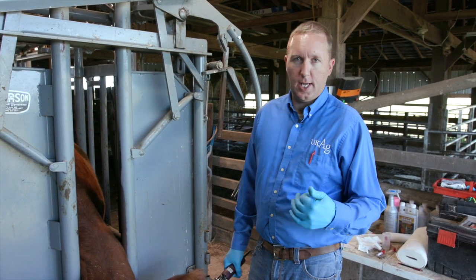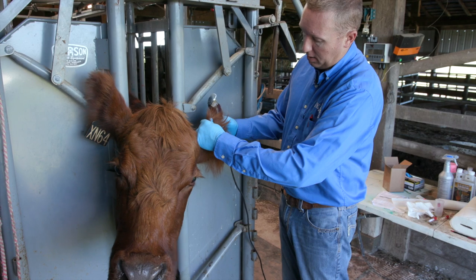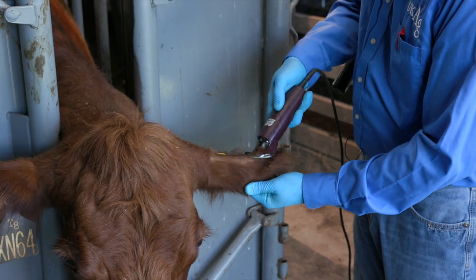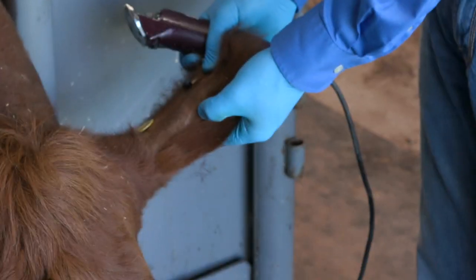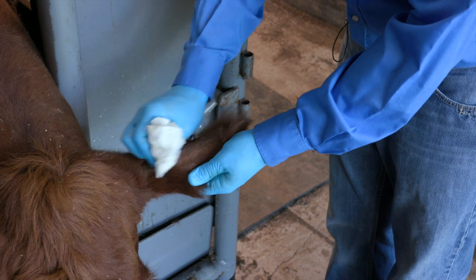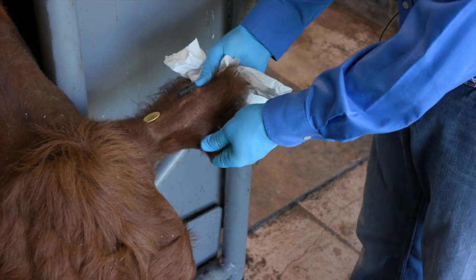There are a couple different places we can take blood for our DNA samples. You can take it at the rear of the tail where you would do a blood pregnancy test, or inside the ear by cleaning the ear and pricking the vein on the inside, or we can take it off the back of the ear. There are two or three veins that we see back here. We're going to clean off the back of the ear so we can better see the vein — it's not a requirement but it does help keep our samples clean, takes out any dirt and debris. Now we've got a good clean spot where we can actually see a vein poking out. We'll use a paper towel with some isopropyl alcohol, brush away any loose hair and scrub it down well to get any debris out and get the best clean sample that we can.